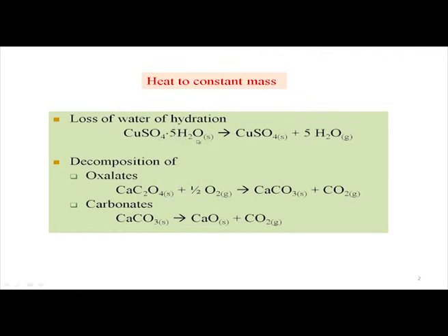There are 5, it is pentahydrate, that is copper sulphate pentahydrate, if we heat it. Not all 5 water molecules will go out in a single step, but one is different compared to the other 4. So, initially we get the sample which is copper sulphate monohydrate, and we also see the color change. That is another good indication for those samples which are colored, unlike your calcium oxalate or magnesium oxalate samples which are white in color.